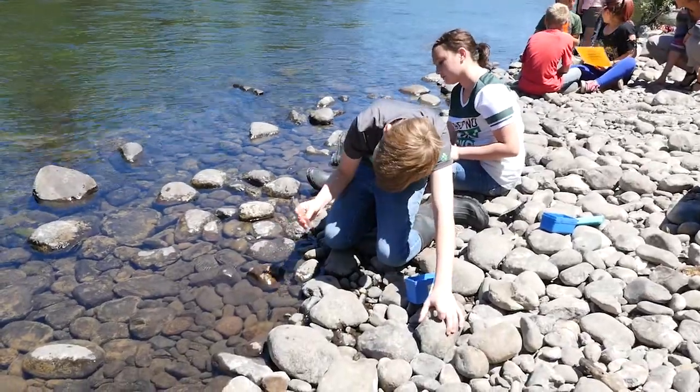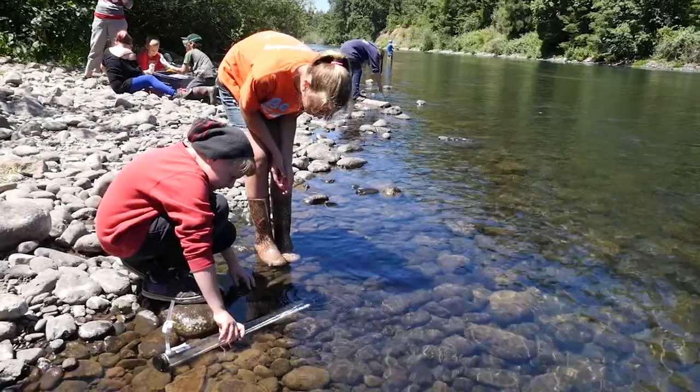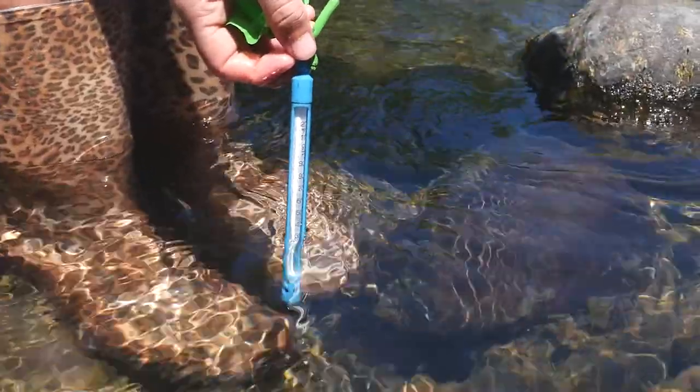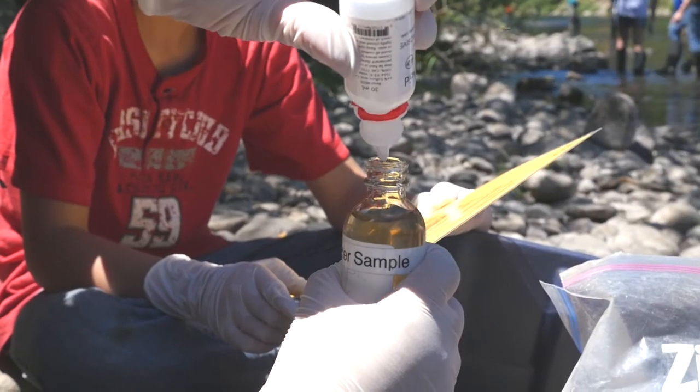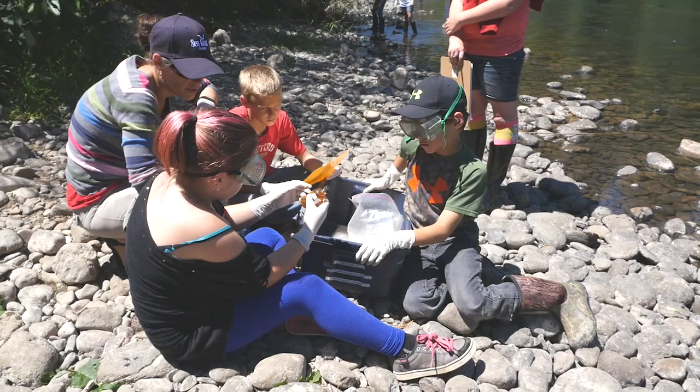One group of students will test the pH of the stream. The next group will test the turbidity of the water. Another group will test the temperature of the water. The last group will test for dissolved oxygen — this test takes the longest amount of time to run.